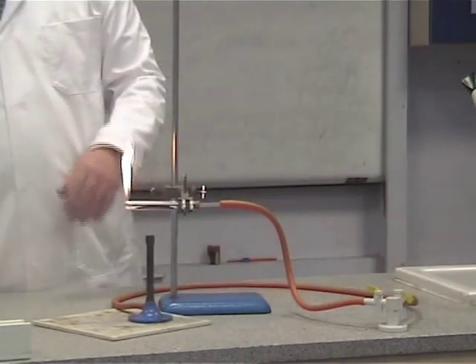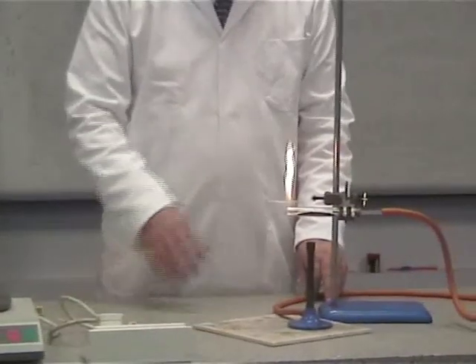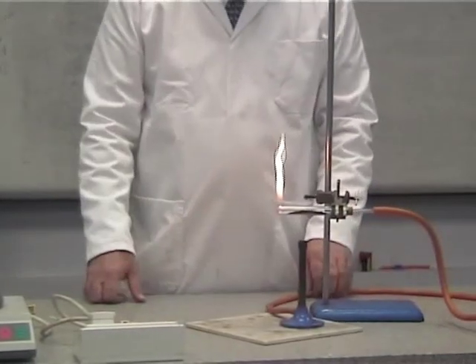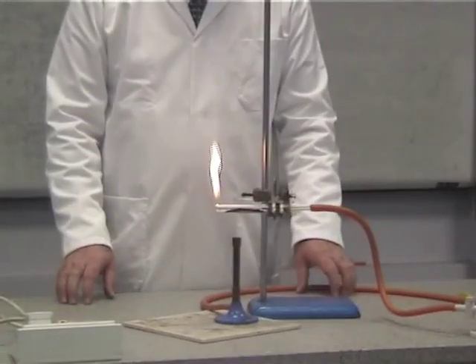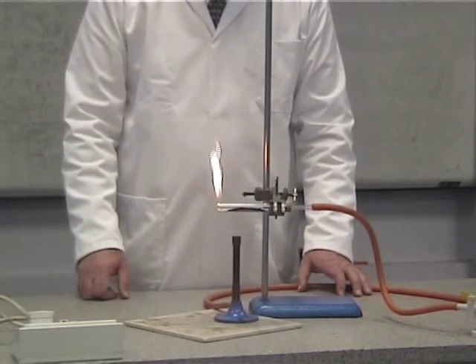So you just need to be very careful and make sure you're turning off the right one. Obviously the tube is very hot, the copper is still very hot. It's not the time now to be turning off the gas that's passing it over. If you do that, you'll start to get oxygen going back into the tube and recombining with the copper to form copper oxide, and obviously that would bring in errors into the experiment.